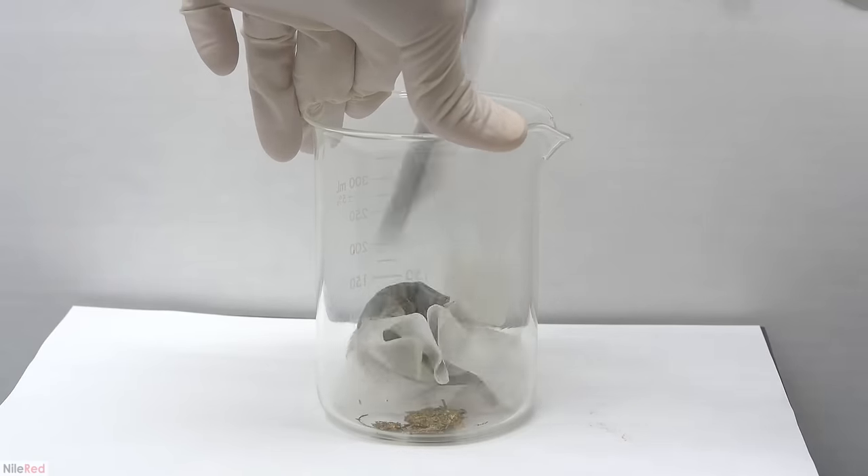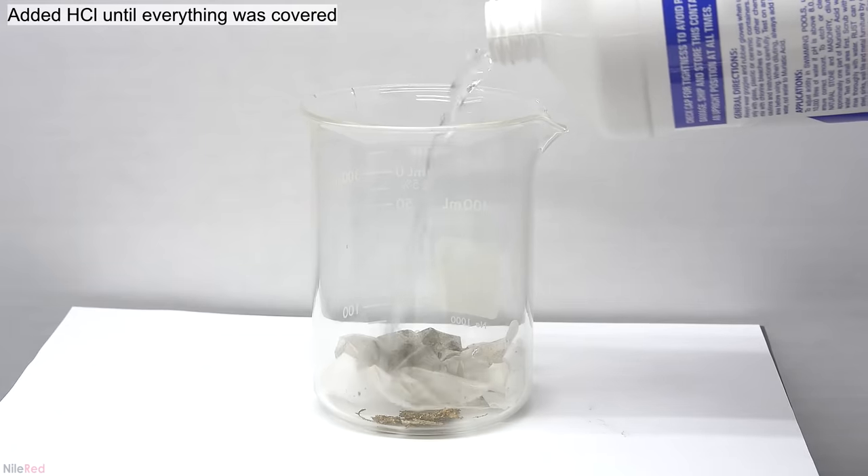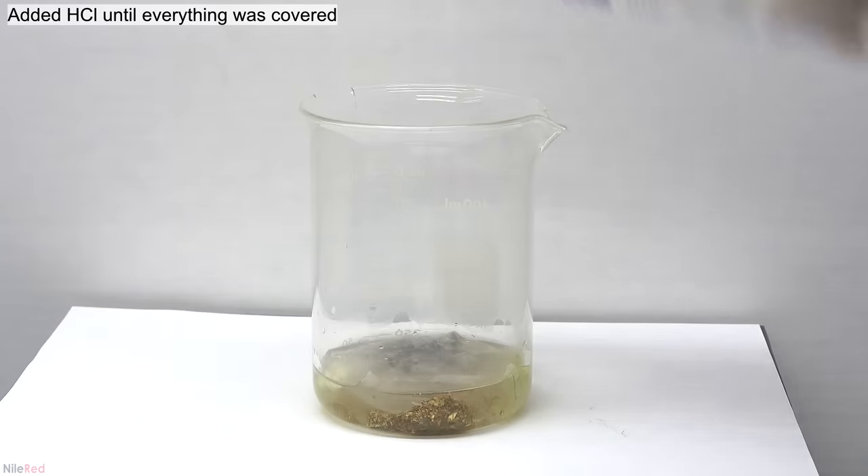What we have to do now is dissolve the gold, and there are two main methods: making aqua regia, or mixing hydrochloric acid and bleach. I'm going to first show the aqua regia method. The first thing we do is cover everything with hydrochloric acid. Aqua regia is made by mixing hydrochloric acid with nitric acid in a ratio of about 3 to 1, so since it looked like we had about 50 ml of hydrochloric acid, I added 15 ml of nitric acid. It's important to note that as long as you're near the 3 to 1 ratio, you should be fine — it really doesn't have to be super exact. At first it doesn't seem like too much is happening, but after leaving it for a little bit with occasional stirring, eventually all of the gold does dissolve.